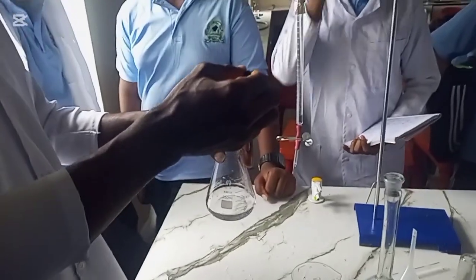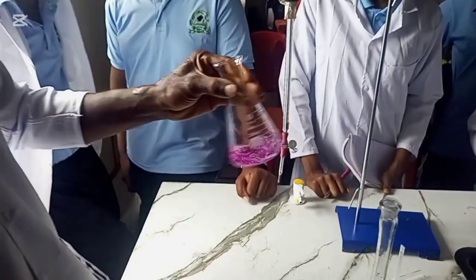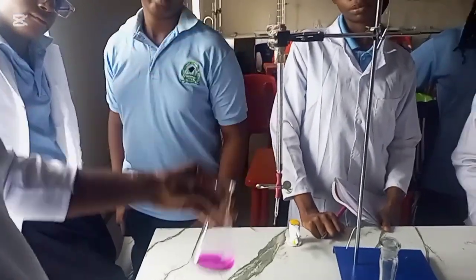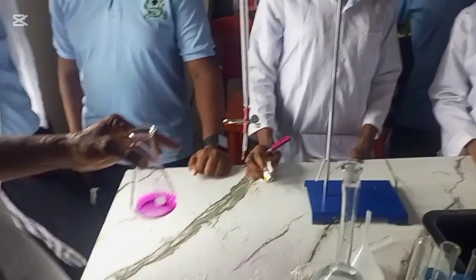So we are going to add a few drops, like 2 or 3 drops. And what's the color? Purple. So the phenolphthalein indicator in base is purple.